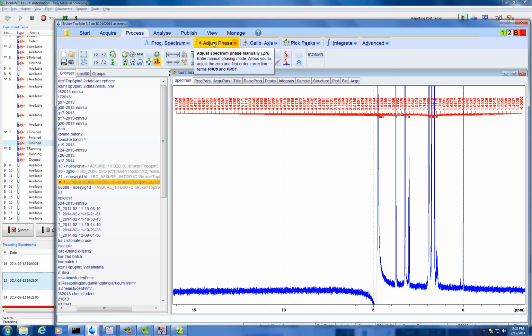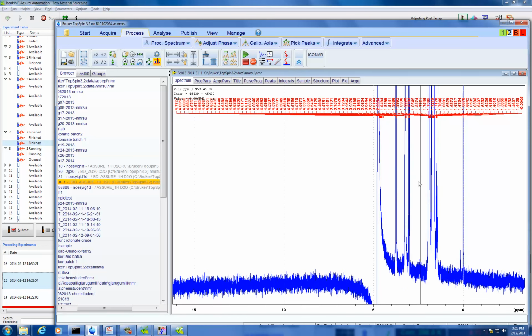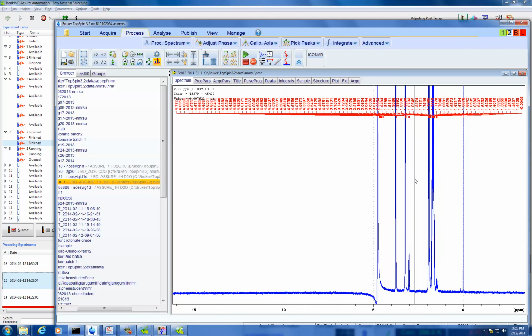The external standard doesn't matter. All it's doing is saying that this proton is this intensity, use this pulse program. It's a separate spectrum, so it just correlates that information, so it knows exactly the power and everything. Once you start running any other compound after, it'll just correlate that. Does it have to be in DMSO? Oh no, it can be D2O.